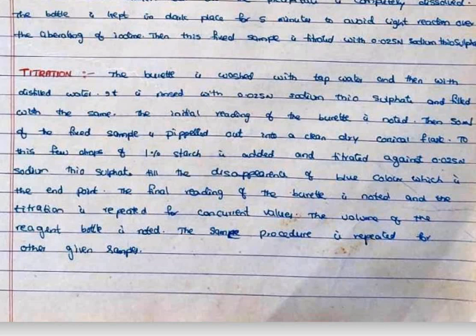Then 50 ml of the fixed sample is pipetted out into a clean dry conical flask.